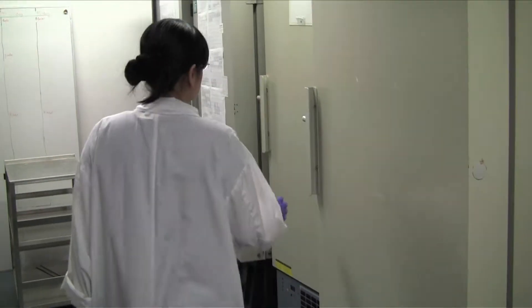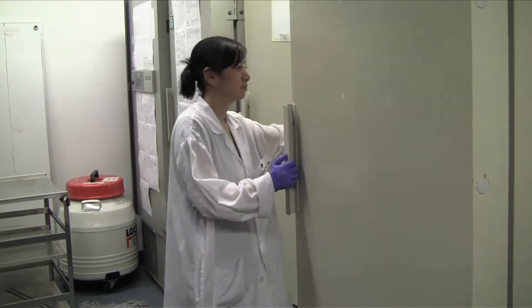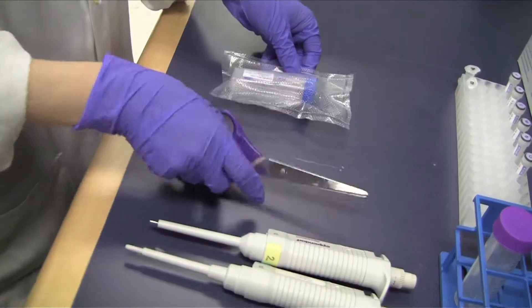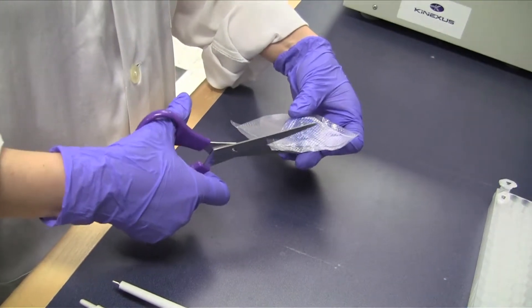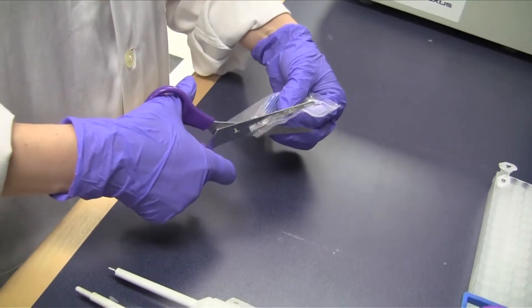Remove the vacuum sealed CAM microarray package from the minus 70 degree freezer and leave the package unopened on the bench at room temperature for at least 15 minutes to avoid moisture condensation buildup on the surface of the array.